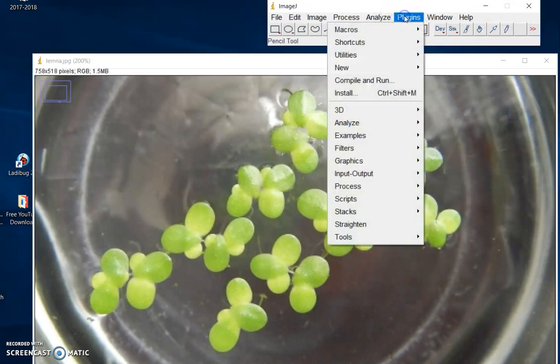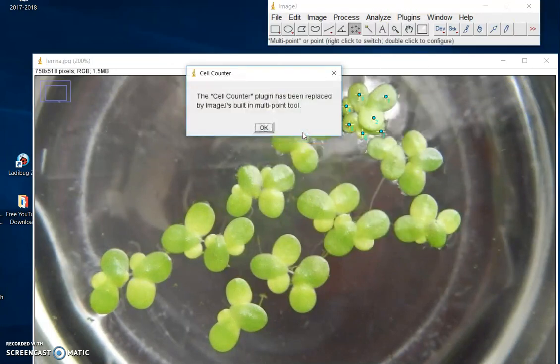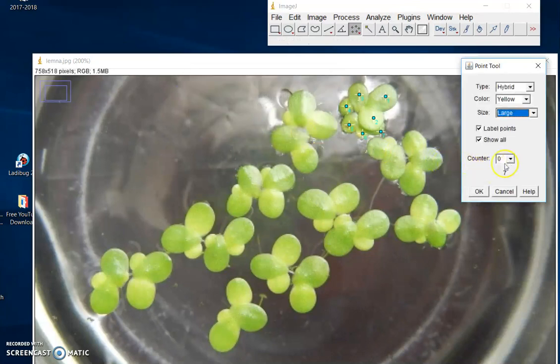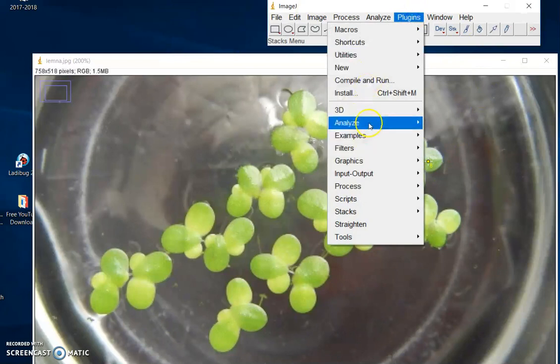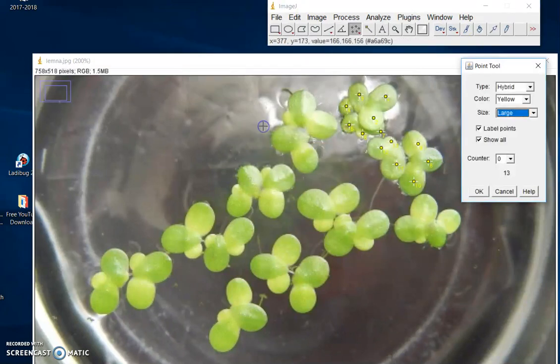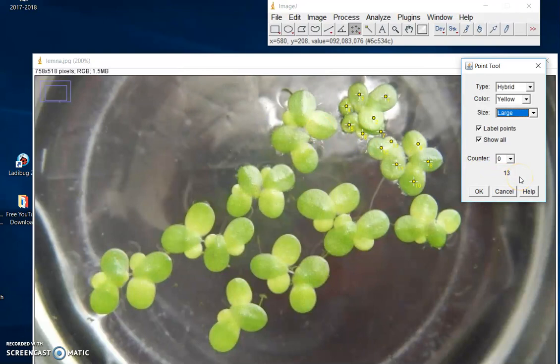Another way is to go back to Plugins, Analyze, Cell Counter — and there it is, it remembers that I have counted seven frogs so far. Let me continue. If you look carefully, you can even see there's a count in yellow. I've got 13 frogs identified and counted, and I will continue.